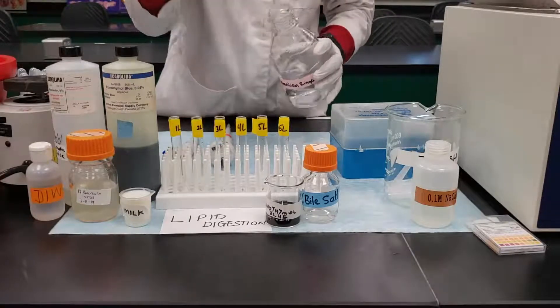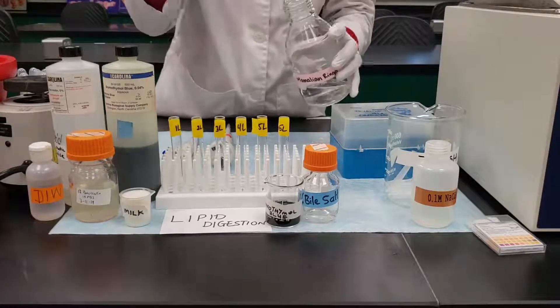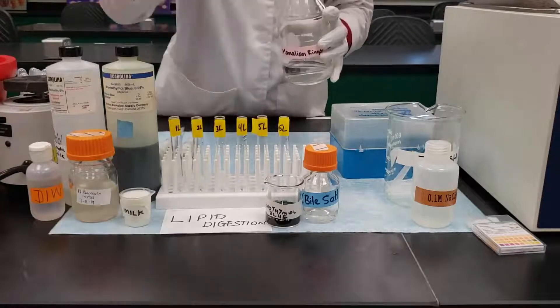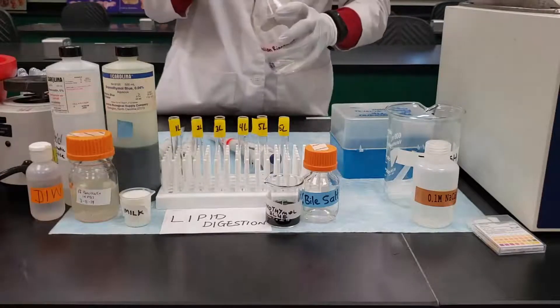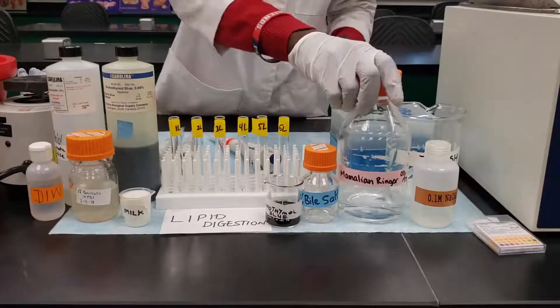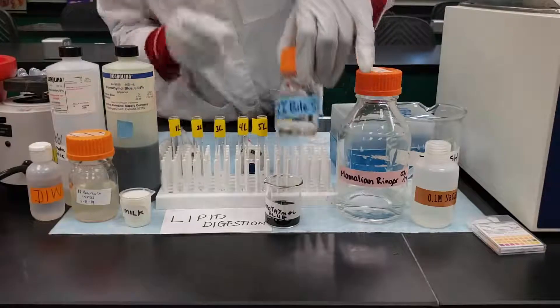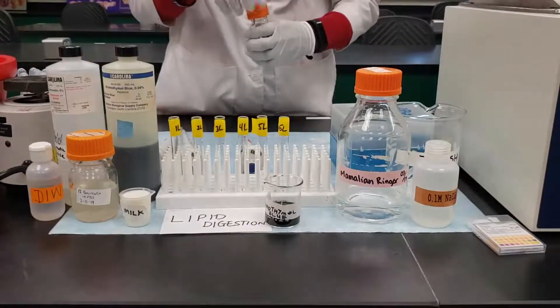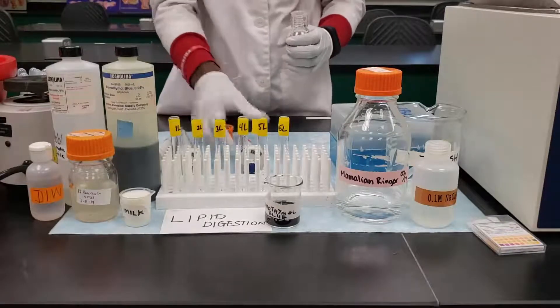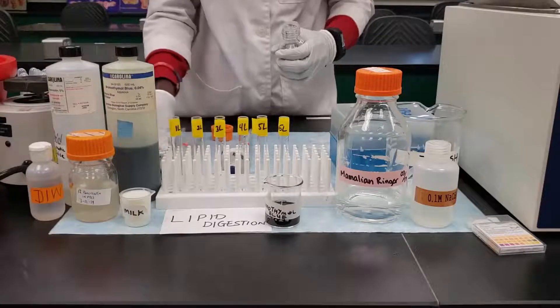Lastly, add 1.3 mL of the mammalian ringer solution to tube 4 — you add 1 mL first and then 0.3 mL afterwards. When you're done with that, the next thing is to take the bile salt and add 1 mL of the bile salt to all of the tubes except tube 5L.